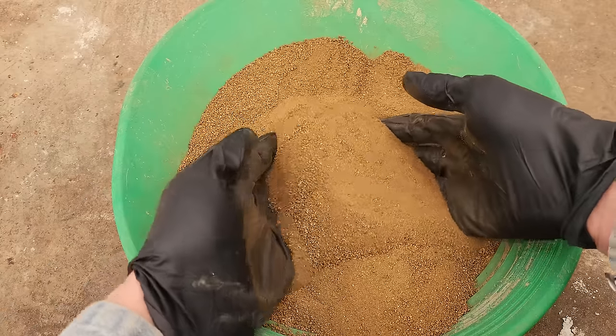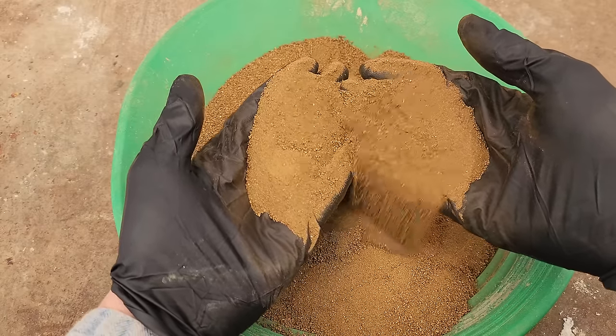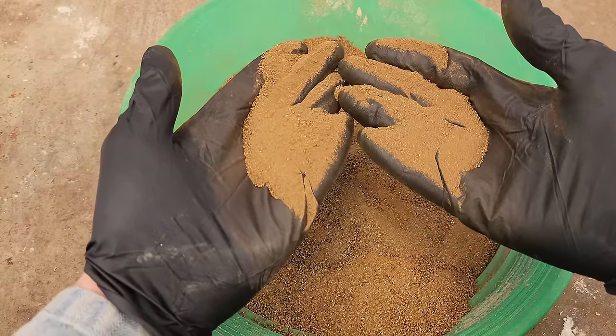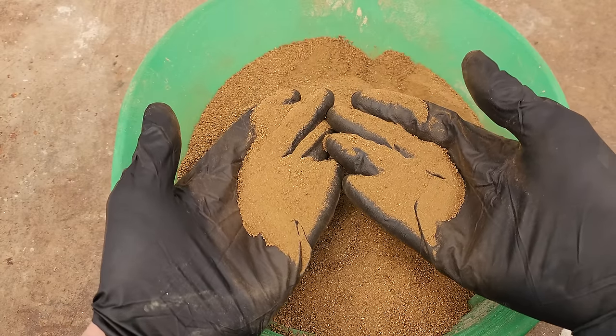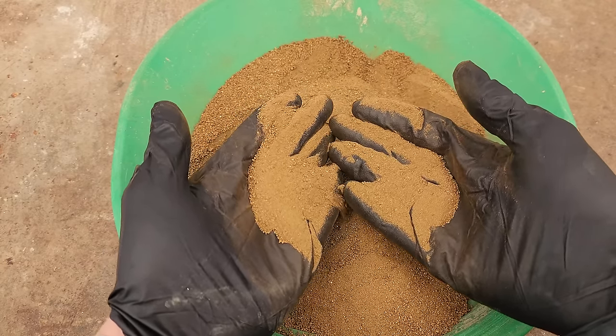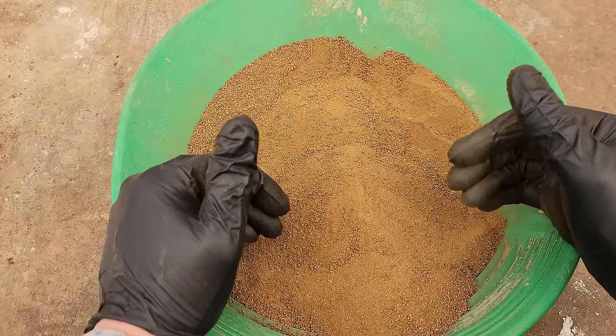We're going to get into the nitty-gritty details on this — what kind of flux I use, why I use certain flux ingredients and what they do. We're going to test the concentrates, get these assayed, and then we're going to test the slag after we're done to see how much gold we lost, and then we can get a real nice percent recovery from our smelting experiments.